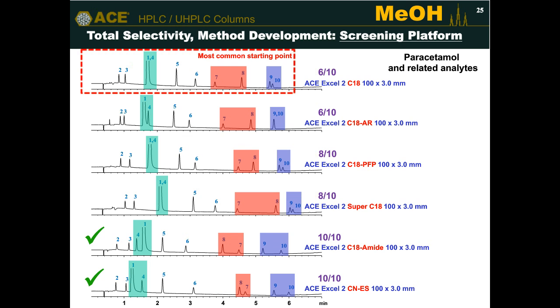And as you can see from the chromatography, we had co-elution of peak pairs 1 and 4, and we had a co-elution of peaks 9 and 10 in the pair. So we would have needed to do further method development, further injections, tweaking the gradient, tweaking the temperature, whatever it is you do for your method development to try and get full separation of all 10 compounds from each other. Whereas with this simple screen, using chemistry to maximize the selectivity, you can see we have 2 options for full separation. So that's the first 6 chromatograms.